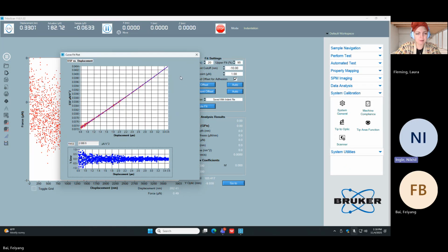I was thinking from the point of view of when you publish the data, you have to show some error margin. So we can show this error margin or not. I would expect that you would be more interested in the error margin on the data itself, which is going to be dependent upon the data, no? Yeah, but from the instrument point of view, like uncertainty, if you do the analysis, you have to consider the instrumentation error. We usually judge that based on the tip area function.